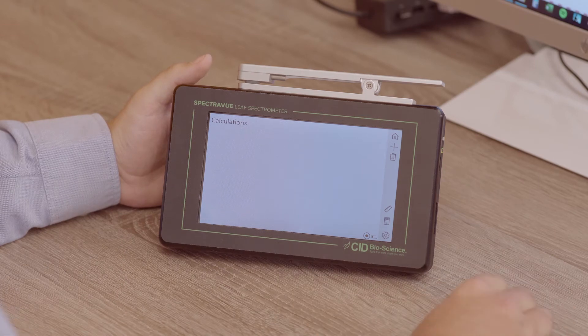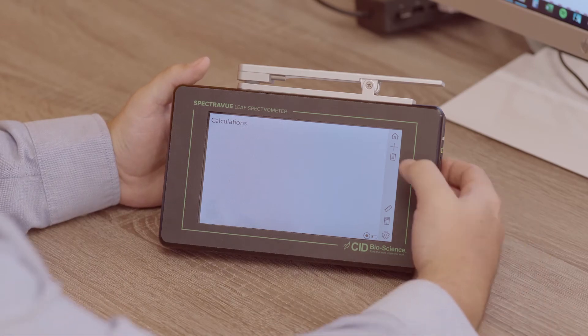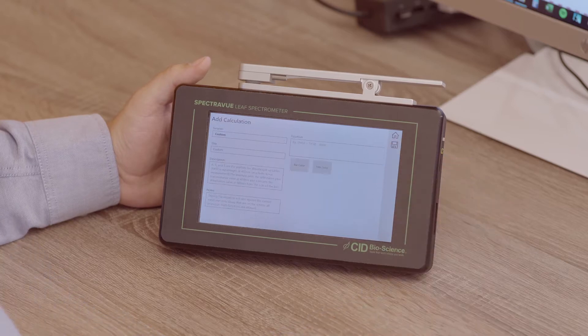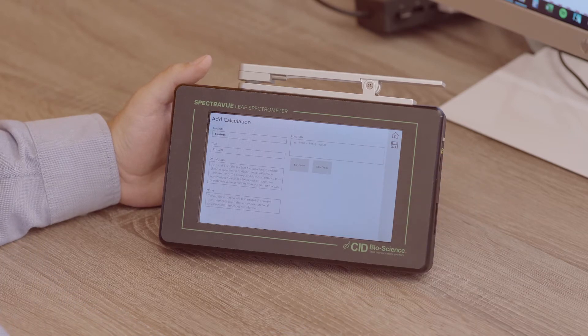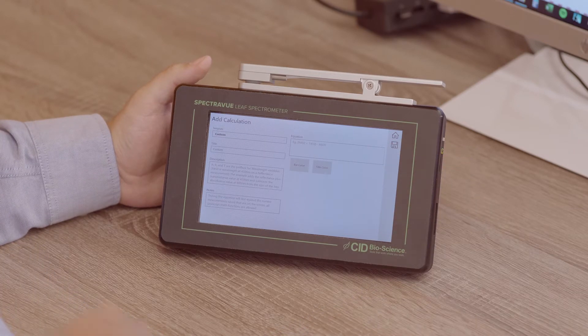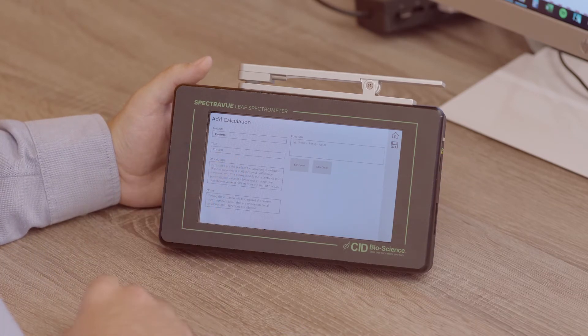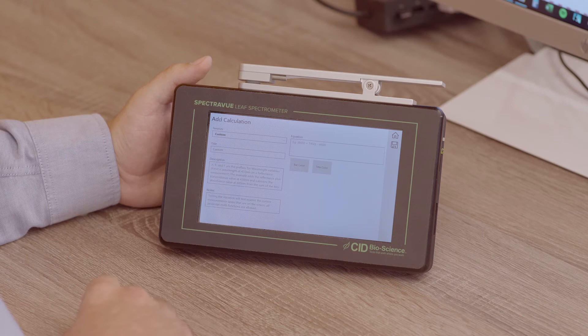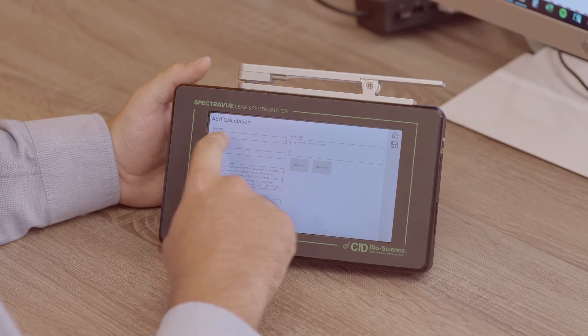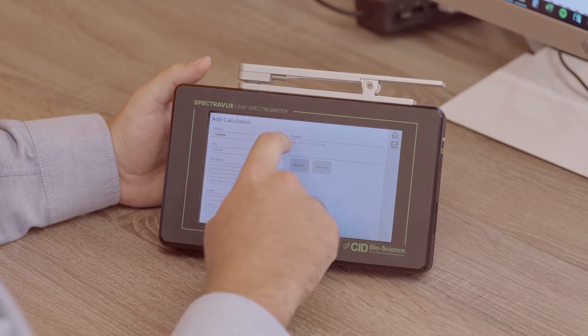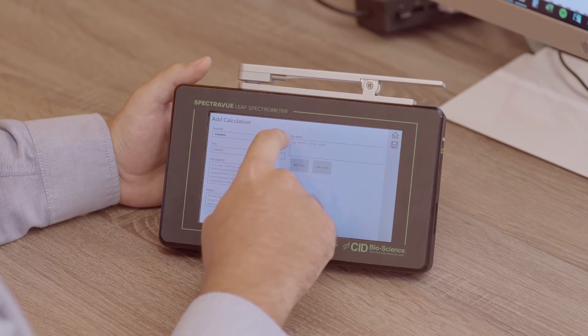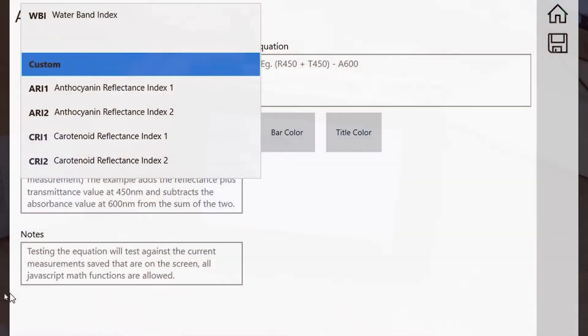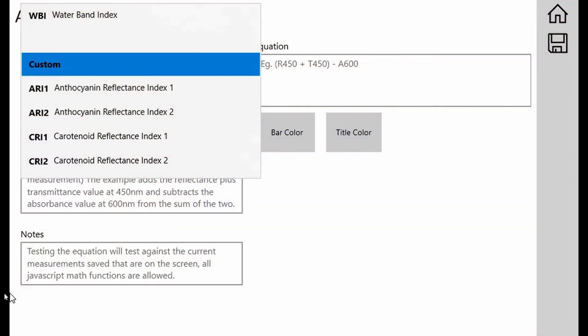Once you're at the calculation screen, you'll want to click the plus button to add a new calculation. Here you'll see on the screen there's a drop-down menu that says custom and the header for that is template. With this drop-down menu, we're going to see a bunch of different built-in indices that are already ready to go, pre-loaded on the instrument.